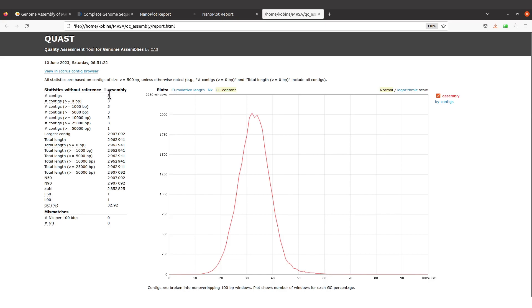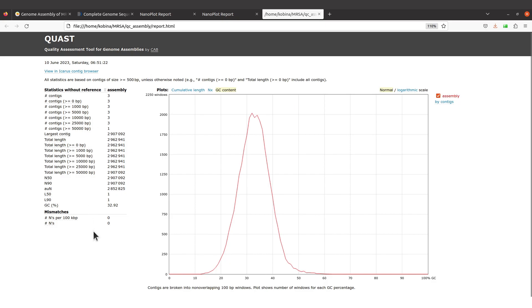That means that some of your contigs had their sizes less than 500 bp, so that's what you should note. If you want the total contigs that are in your file, the original file, then you have to check this one here: contigs greater or equal to zero bp, and that one will give you everything in the original file.